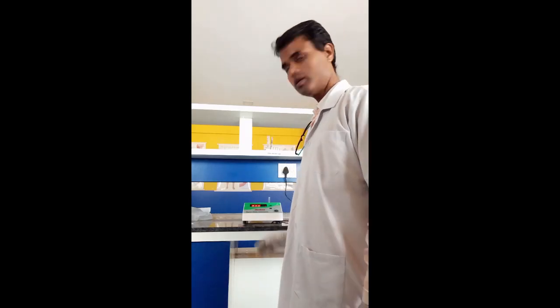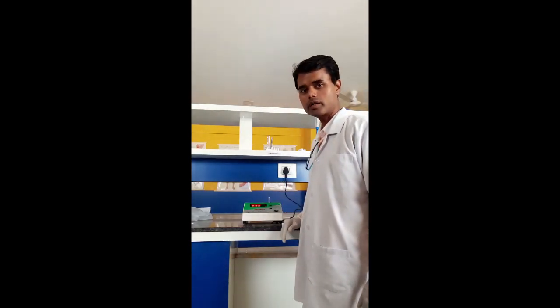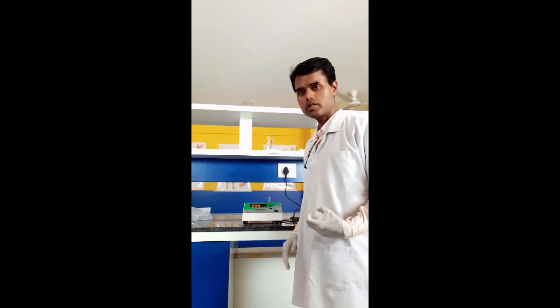Good morning, students. Today we are again having another practical of biochemistry subject, that is to study the colorimeter and demonstration of it and its components and uses. As you know, this is a colorimeter, a digital photocolorimeter, and it is used for determining the concentration of various analytes, means various components, chemicals in our body fluids, such as serum.